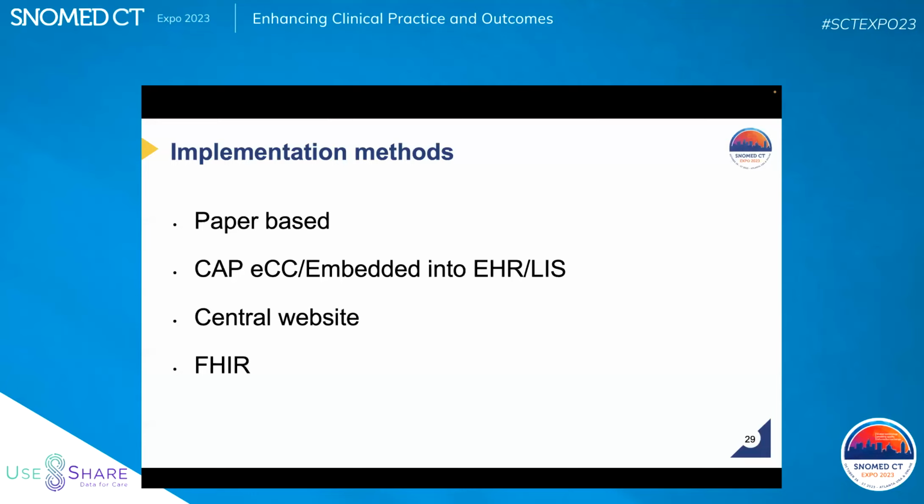There's a reason they did it this way, because there wasn't a web-based approach, FHIR didn't exist yet, SDC did not exist yet. The only way was to get this into a vended system, but there's a certain risk here, and we'll talk about that, which is you have to trust the vendor to do it right.